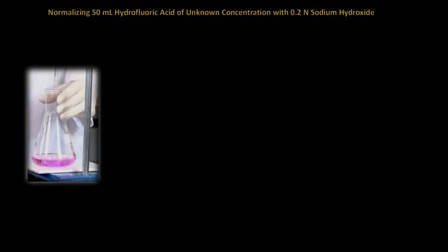Now that we have discussed the basic knowledge around the acid-base indicators, how to choose the right indicator, and verify the indicator of choice, I can now talk about the how-to of determining the concentration of an unknown acid or standardize an acid using a primary standard solution.